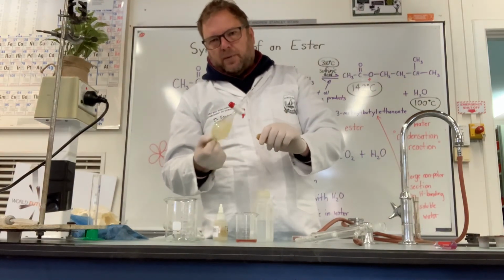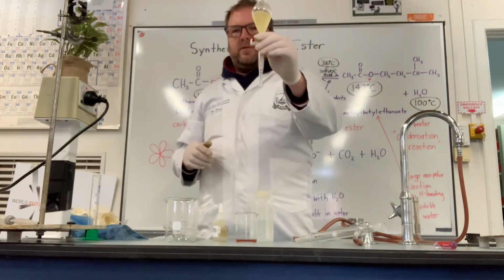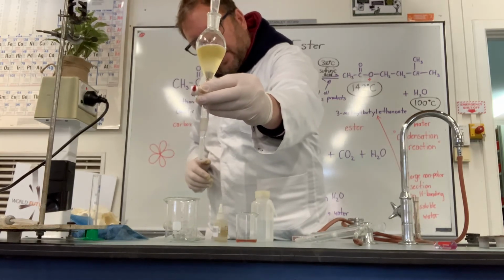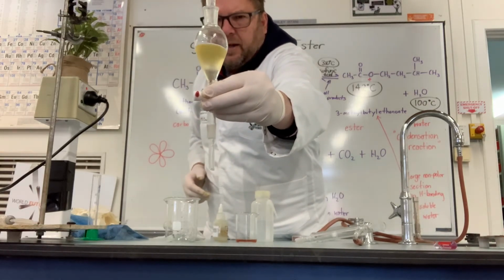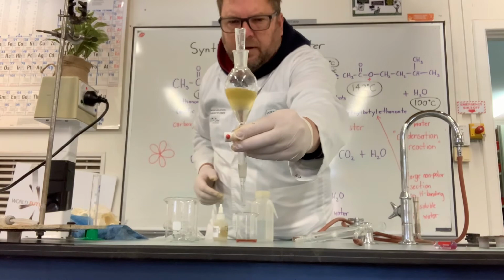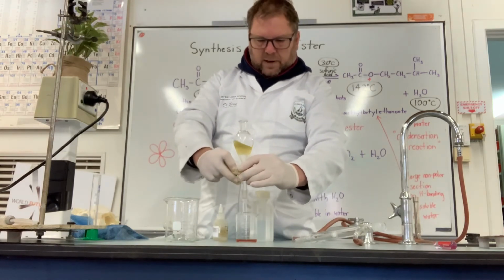Okay, we're seeing a little pop there, but not getting as much gas produced. So I'm just going to let that settle out. You'll see as that settles out, it settles into two layers. That top layer is our non-polar layer that has our ester. That bottom layer that's becoming clear now is our aqueous layer. Just let that keep settling out. That's reasonably settled out now. And again, I'm going to take the stopper out so it runs. I'm just going to let that bottom layer go.